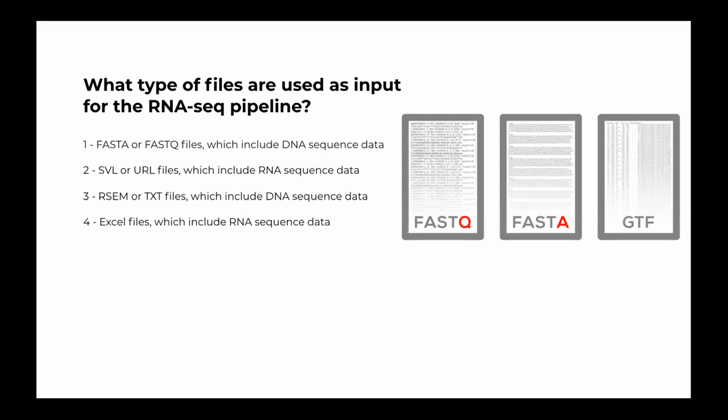So remember, as we covered last time, it is important to remember that FASTQ files provide us with reads from the sequencer. So that's how we get the reads from the sequencer. It's a text-based file format that stores nucleotide sequences and reads, and also quality scores for each letter. If you remember, last time we saw the FASTQ files.